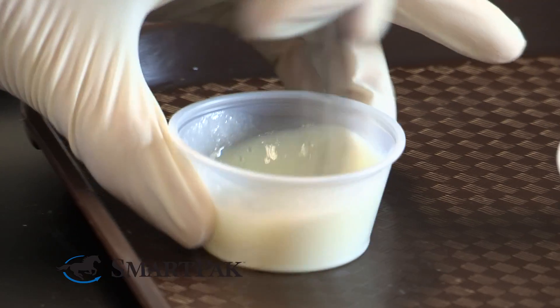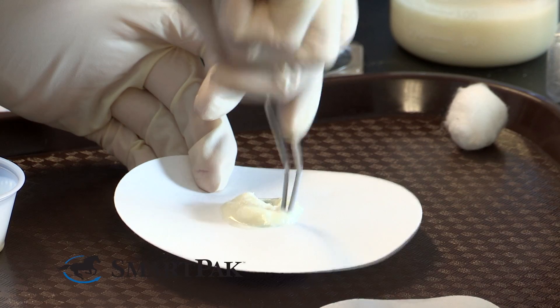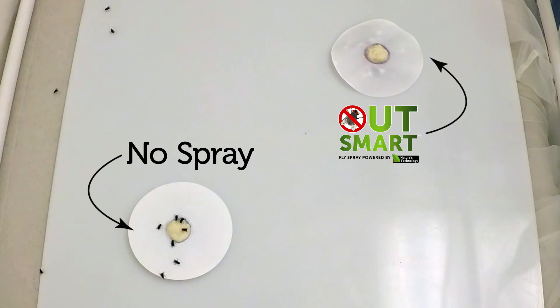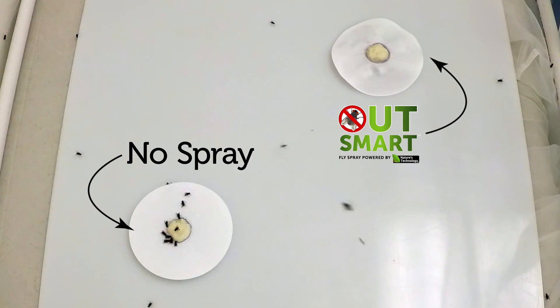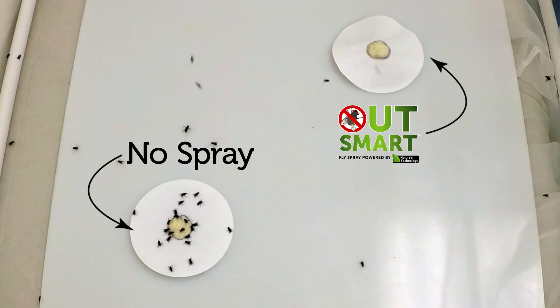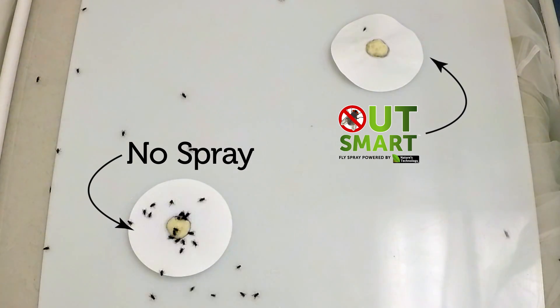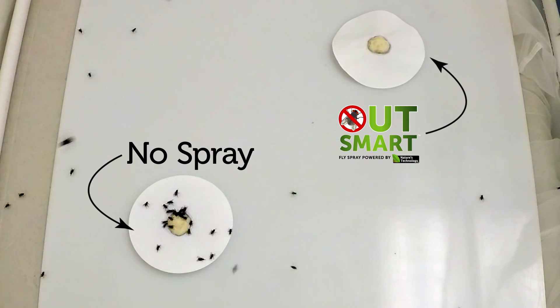The flying cage assay is a simple two-choice assay. Two bait stations are placed in opposite quadrants from each other on a grid on the floor of the cage. One is untreated and one is treated with the Outsmart formula. Around 150 to 200 house flies were placed in the cage and over the course of an hour we took still shots of the inside of the cage. In the lower left quadrant is the untreated disc and filter paper. The flies are responding heavily to that disc and nothing is responding to the treated disc in the upper right quadrant.